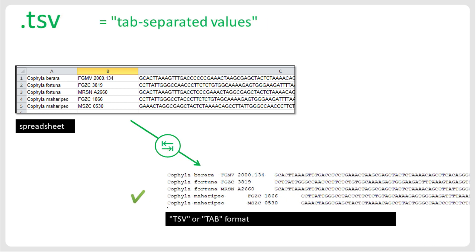To avoid confusion, we have therefore adopted the TSV format in iTaxoTools, where the separator is a tab character. As in the CSV format, records or lines are separated by new lines, but in this case, the values within a record are separated by tabs.